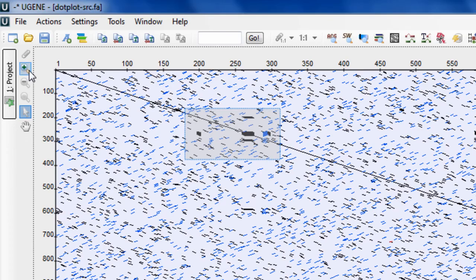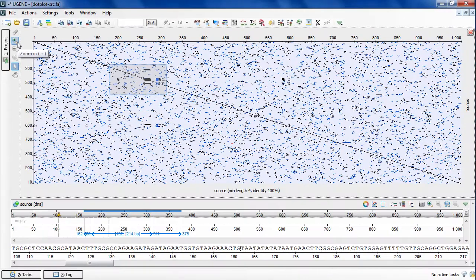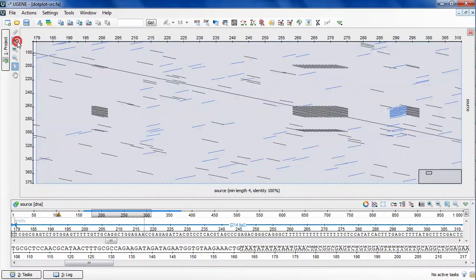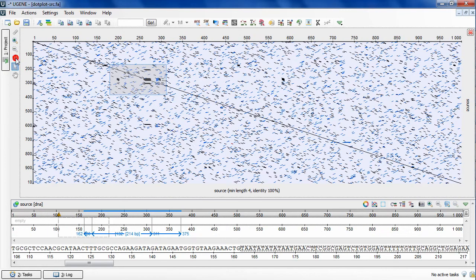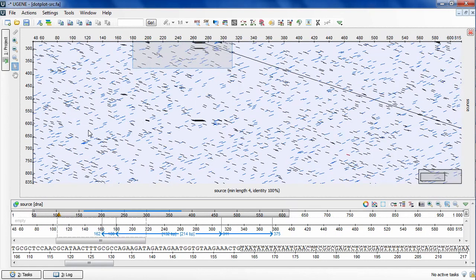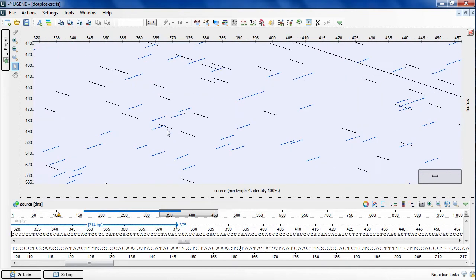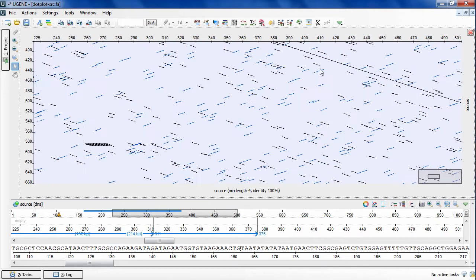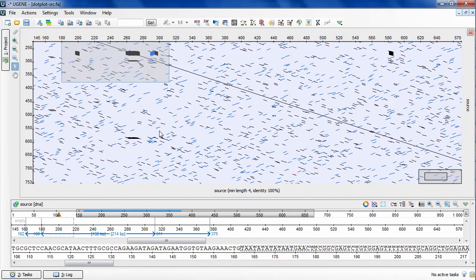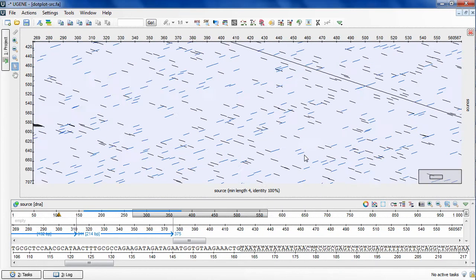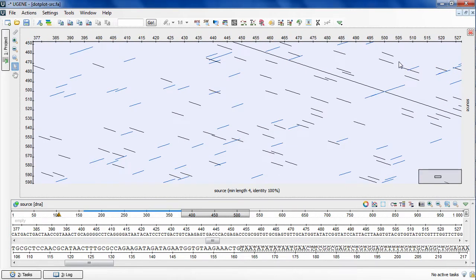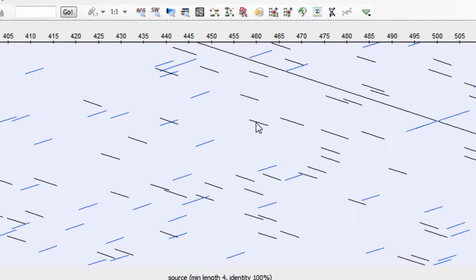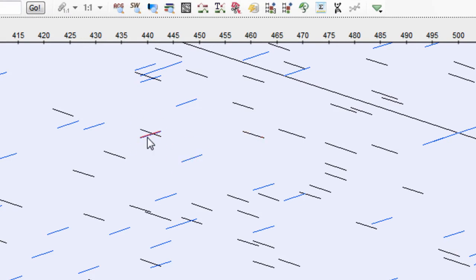Zoom in or zoom to selection if there is one. Zoom out and reset to 100% zoom. But also you can zoom by rotating mouse wheel and pointing mouse cursor at the desired direction. In this case, the dotplot will be zoomed and the center of the zoomed area will follow your cursor for more accurate zooming. Also notice that repeat selection becomes more accurate as well.